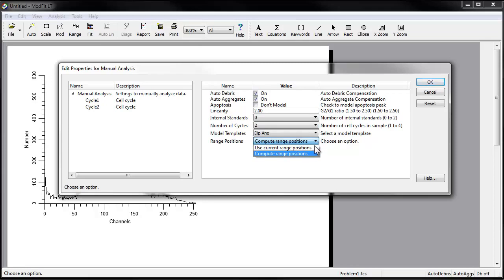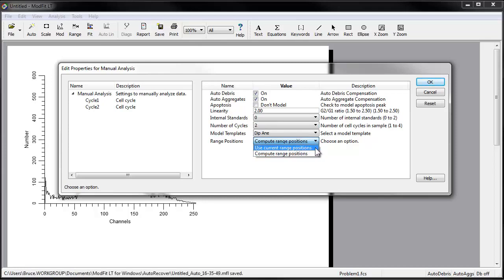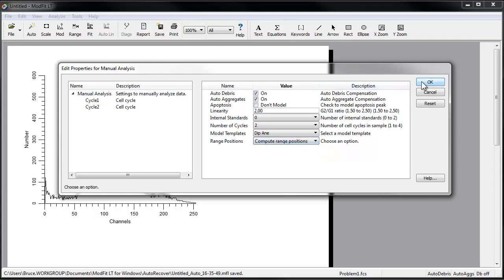Click OK to confirm your choices and close the dialog.